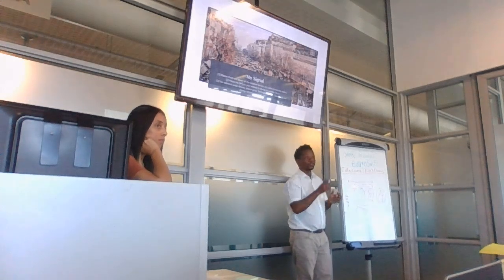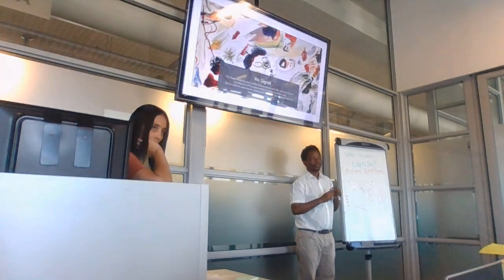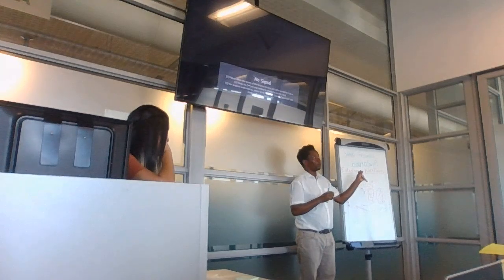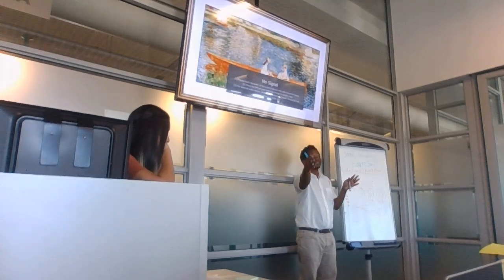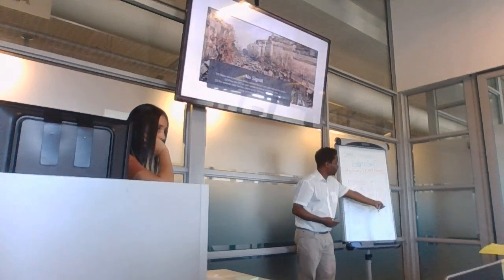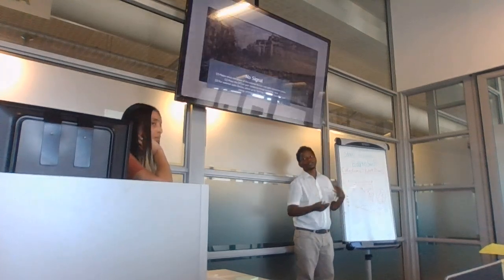It's my conceptual understanding that it might work, but then we are working on something like maybe 70%. Remember, in this case, we just want to ask a very simple question. Maybe we don't want to assemble a gene. We're asking: is what I have consistent with something that you already have? If that's the question, then if you just run one of them, it will answer that question. It's sufficient, and you also save on computational time. You don't need to do the same thing twice.